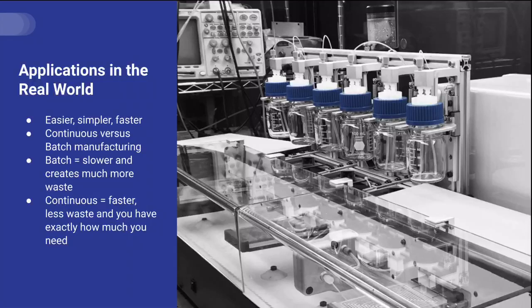Chemical synthesis is the process of performing chemical reactions. Our goal is to create an automated chemical synthesizer that can mix two colored liquids together in a predetermined ratio. A project applicable to the real world? Yes. In labs all over the world, automated chemical synthesizers are used to ease the process of creating chemical mixtures.